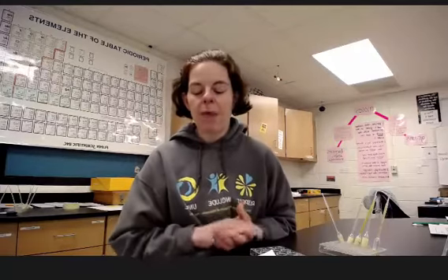So when you see a precipitate forming, you're going to notice it not as like a big solid chunk, but you'll see that the solutions you have get cloudy. So when you mix two clear solutions together, if they get cloudy, that indicates there's a precipitate. And that precipitate happens because the cations and the anions actually connect together. Think of our chunk of salt, right? They kind of bond together like a magnet. And those connected pieces are insoluble, which means they're a solid in solution.